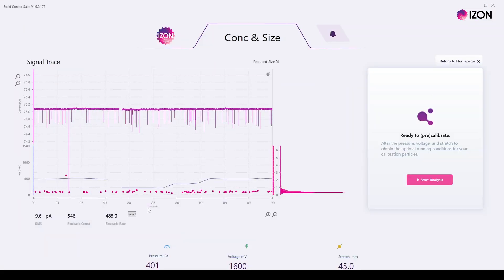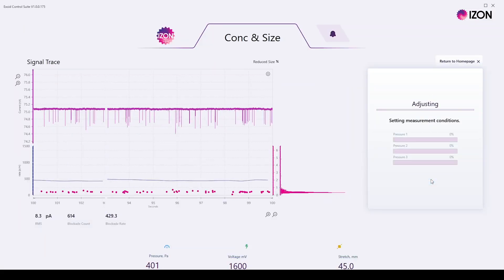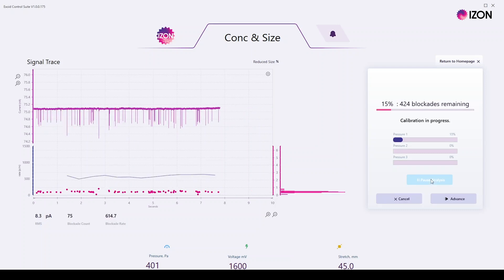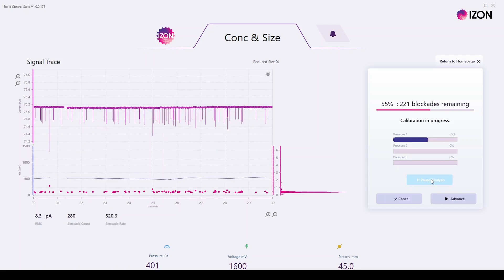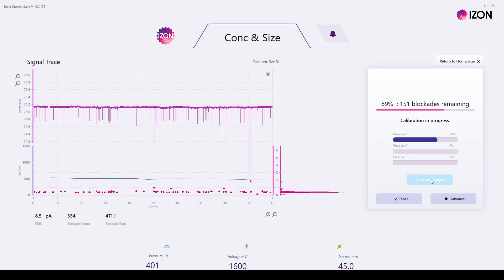Lowering the stretch to 45 millimetres and increasing the voltage to the maximum of 1600 millivolts improves the blockade size to 0.4 nanoamps, but this lower stretch has a higher risk of blocking which may require intervention to achieve a successful measurement.